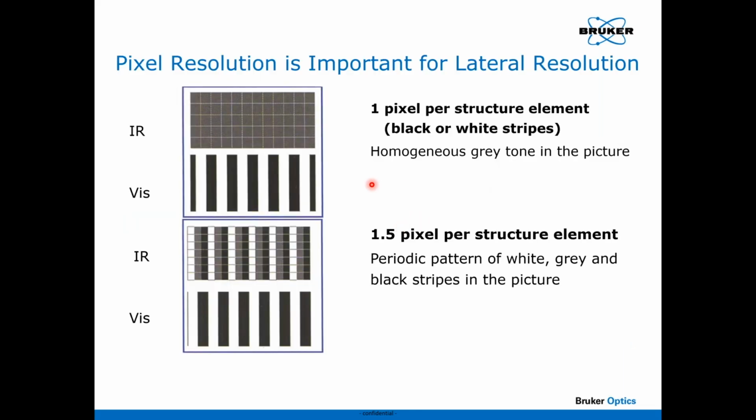And before we look at some examples, we have to understand resolution. Say we want to resolve features or contaminants or layers in a multi-layer film, how small can we go? That's always the question of interest. Well, as it turns out, the Nyquist theory applies here. So if you say, I want to resolve, say, 10 microns, and you only have a pixel or a point every 10 microns, as shown here in the top part of this figure, you can't resolve the edges of this pattern.